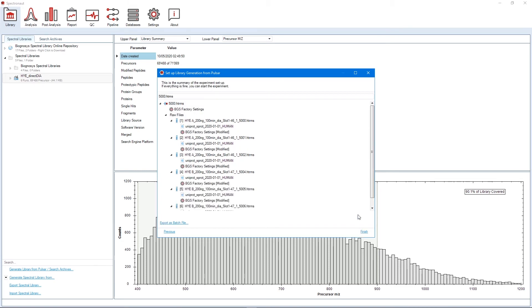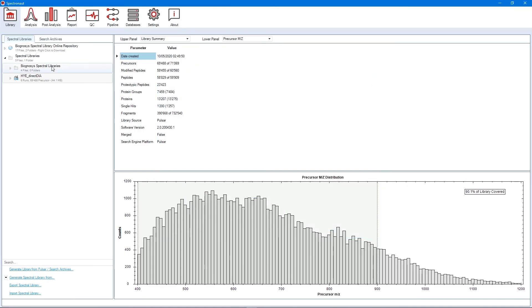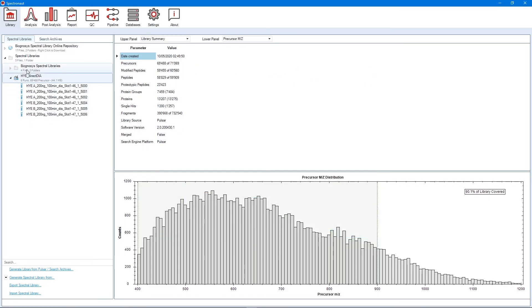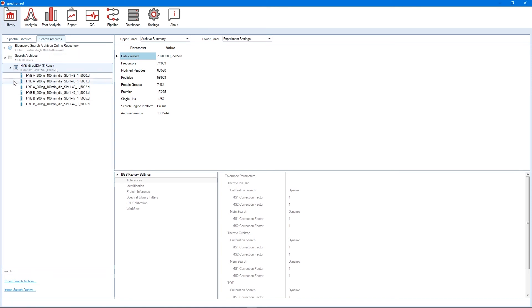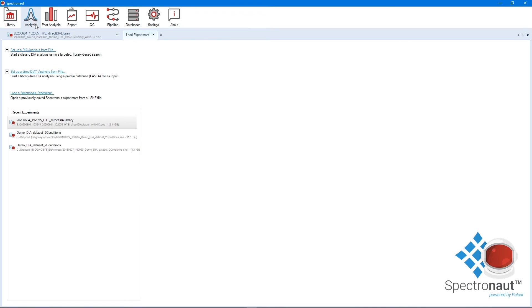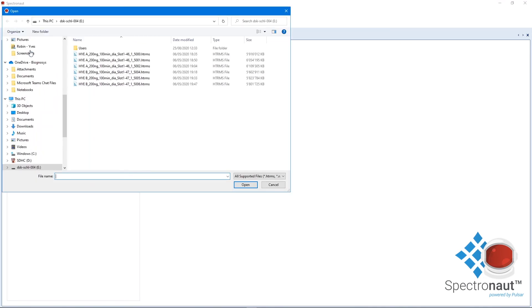Once generated, the spectral library will appear in the left panel. Every time you generate a library from Pulsar, the search archive will automatically be saved and shows up in the search archives tab. You can now proceed to the analysis perspective to set up a traditional DIA analysis and assign the generated DIA library.